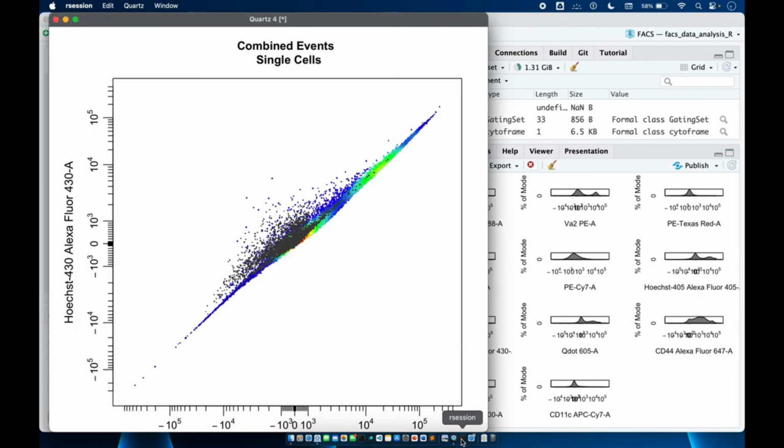Now you can see the population of the live cells here, and these are some of the dead cells. For the rectangle, you click the diagonal points, this particular portion, and you use this particular point, and you can see these are the live cells and these are the dead cells. This is how you can annotate them. Dead cells percentage is around 42.69 and live cells are 57.31. Don't worry about the results, these are not accurate, this is just for an example.